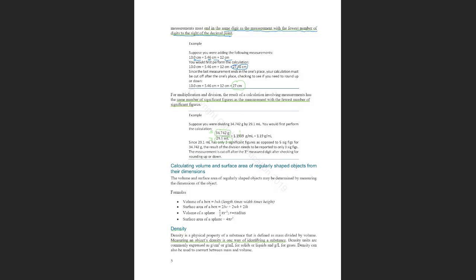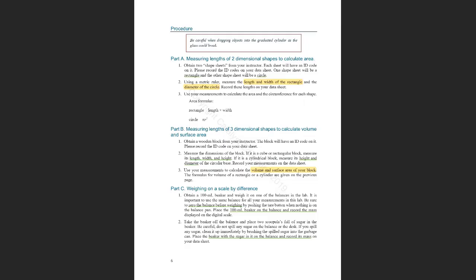So you're going to measure the mass, measure the volume, and calculate the density. And here they are explaining the 5 different parts of the experiment. So we can go quickly over them, and then we'll go over the report, just to look at what is involved and what we are going to do in the report.